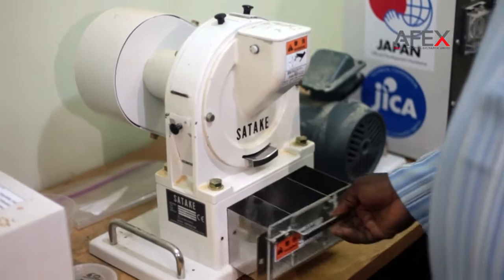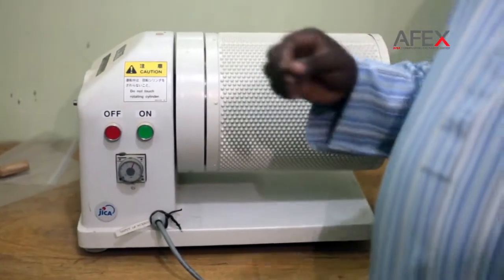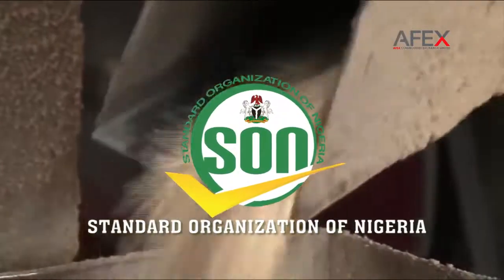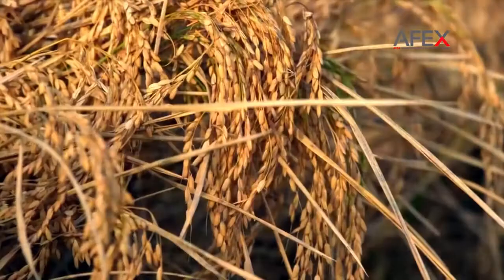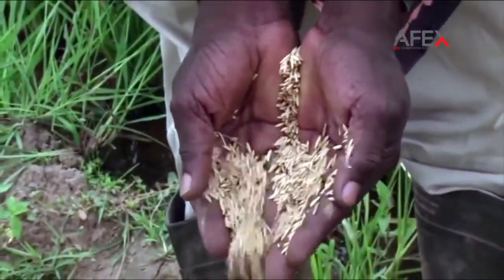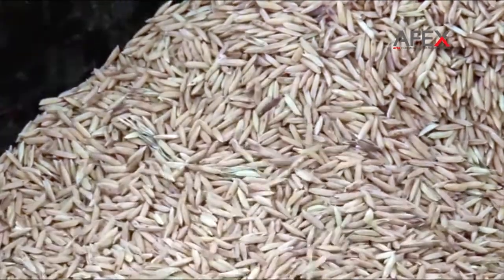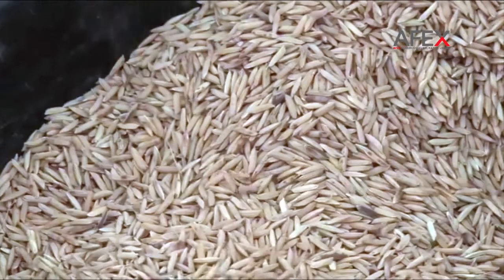This quality checking will help rice farmers, paddy dealers, rice mills, seed suppliers, and extension agents evaluate the quality of their paddy against the benchmark of the Standards Organization of Nigeria. Knowing the quality of paddy rice helps the farmer know what needs to be done to obtain better quality paddy. Higher quality paddy commands higher price in the market and, on a bigger picture, facilitates substitution of imported rice with locally planted rice.